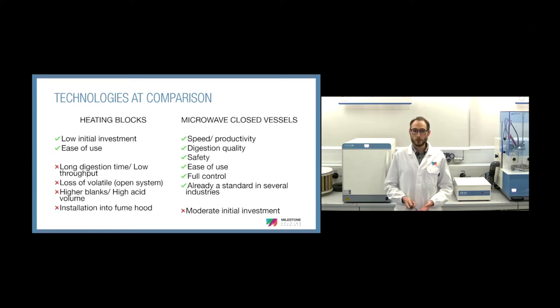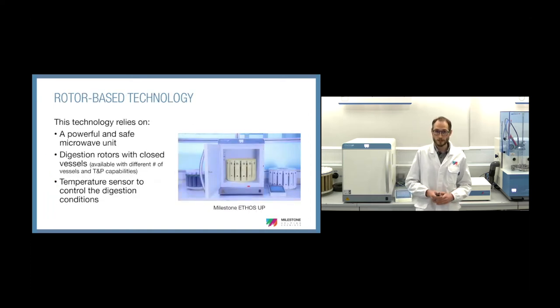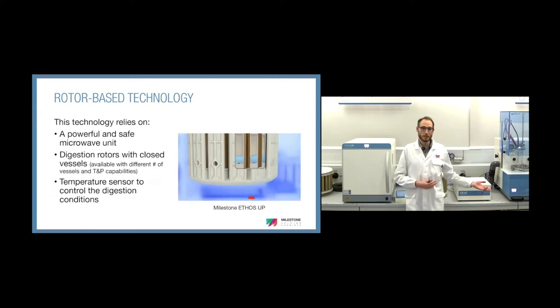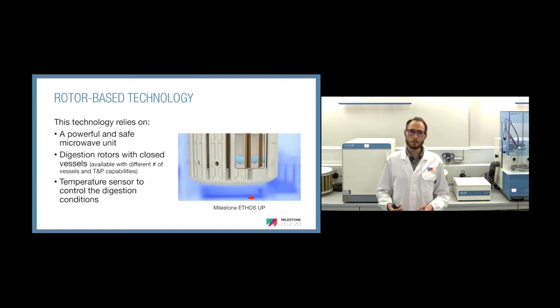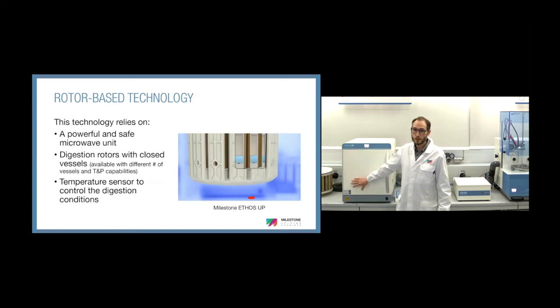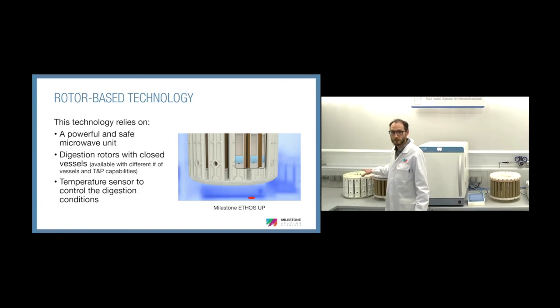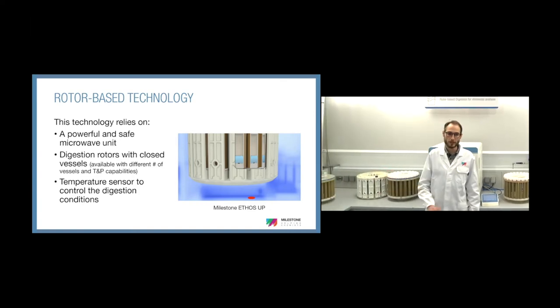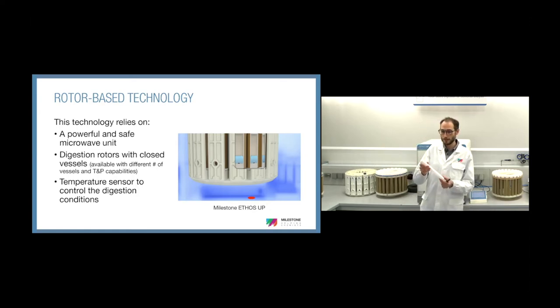And as I told you, there are several different microwave systems available on the market. The rotor-based and the single reaction chamber are the two main used technologies. The rotor-based technology basically means it's a microwave oven like this one, and this oven works in combination with rotors. There are different kinds of rotors according to the application, where each rotor has vessels where you put the sample and the reagents inside.